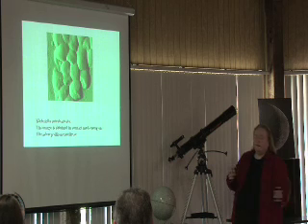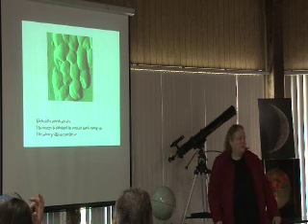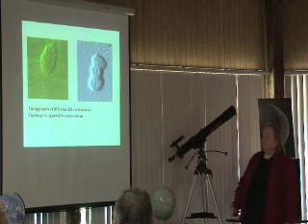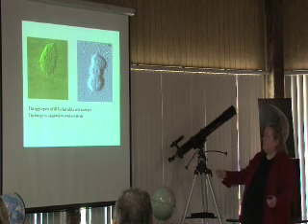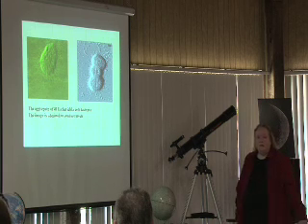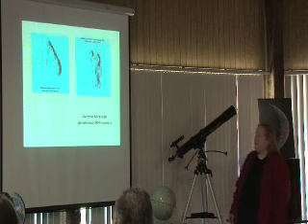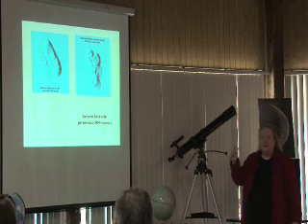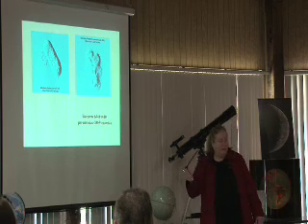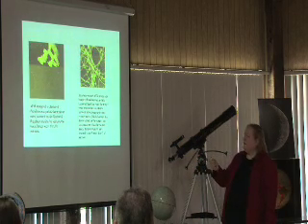And these are bacteria. Of course, bacteria are something that you can measure and look at with an AFM. Bacteria are round or flat or square. We can look at the different types of bacteria in a way we never could see before, with the intimate details of how the surface changes when you have an antibiotic bind to it. That's what we care about, killing those bacteria most of the time.